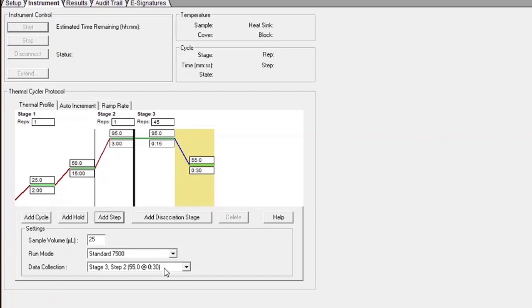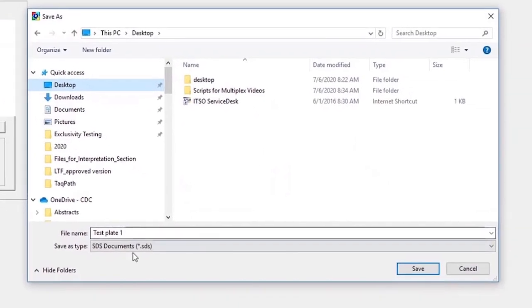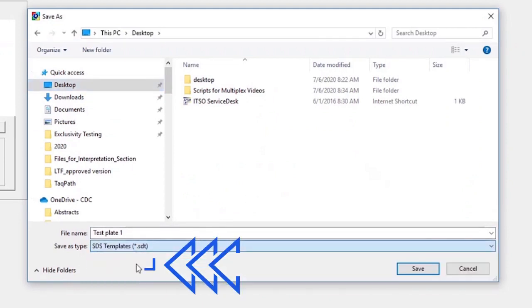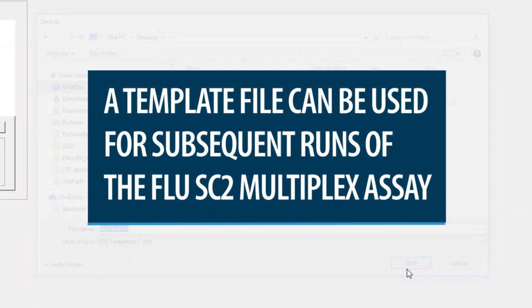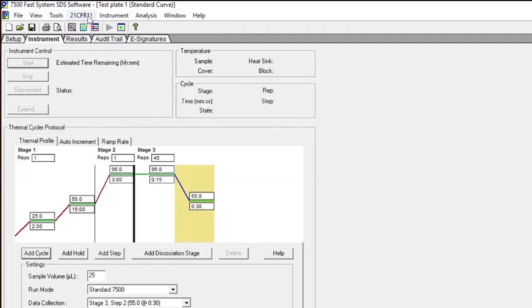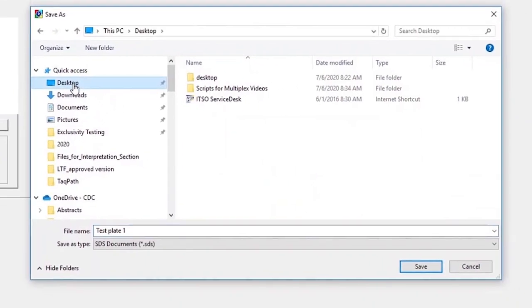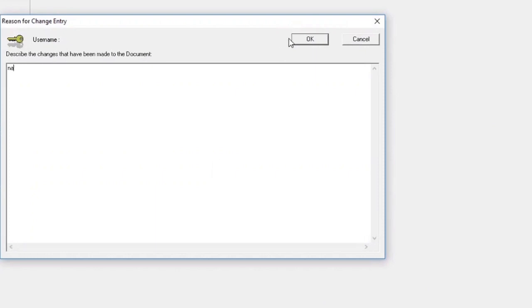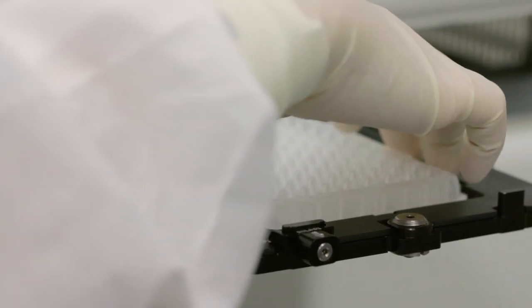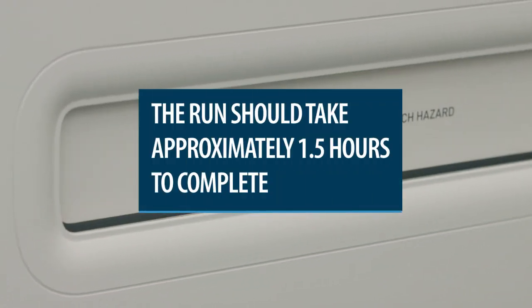This file can now be saved as a template file by clicking File, then Save As, and selecting SDS Templates (.SDT) in the Save As type box. Save in the appropriate folder. Save the run file in the appropriate run folder designation — this file is where the data from the run will be stored. Load the plate into the instrument and click the Start button. The run should take approximately 1.5 hours to complete.